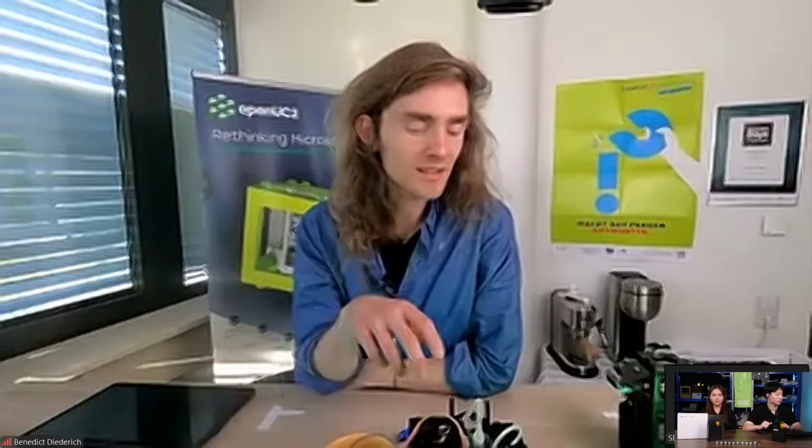If you go online and look through our documentation, the first idea was essentially having one of these little pieces here, one of these adapters that just fits the Xiao camera inside. The Xiao camera is nice because it has USB-C, which is nicely adaptable, and it's much more robust than the ESP32 camera it was before. And you can customize it. For example, one thing we did: you take a snapshot and it's automatically uploaded to Jena. This is something you cannot do with a webcam, or you can just operate it with your tablet or something. So this is cool.